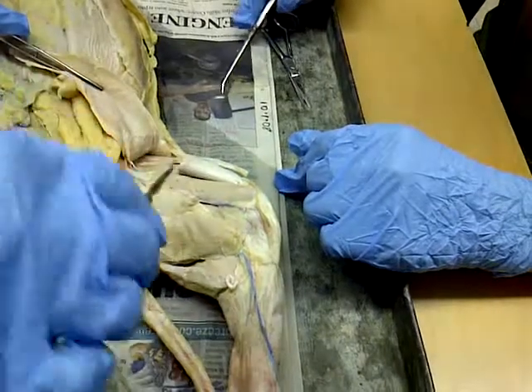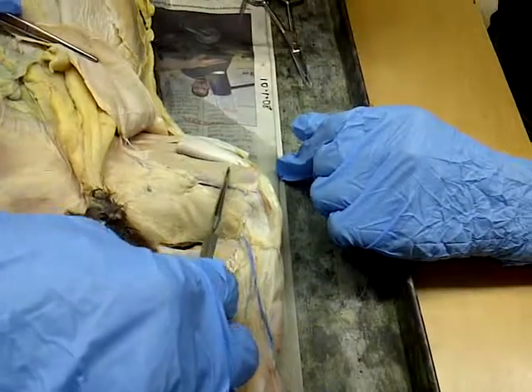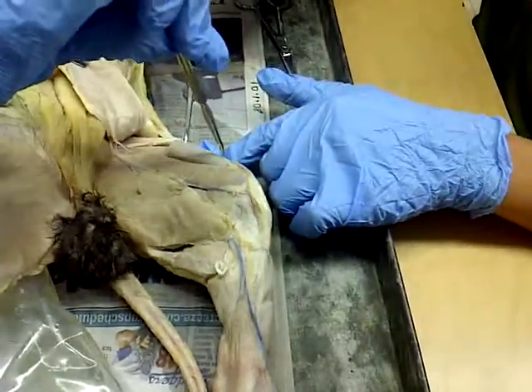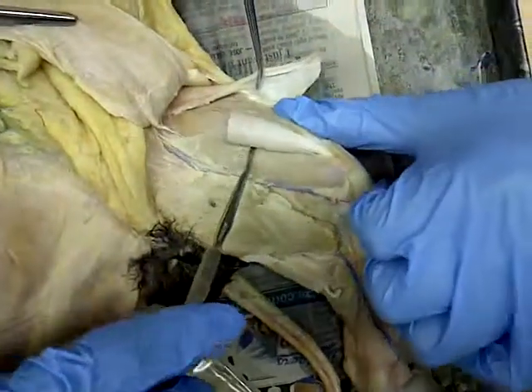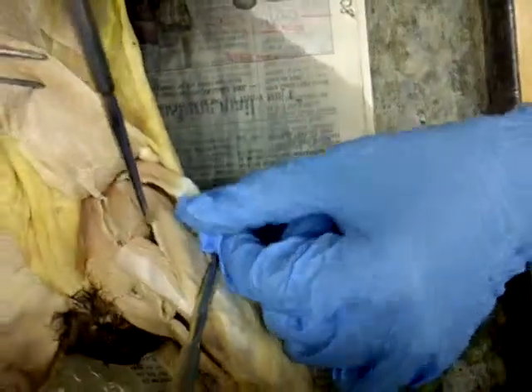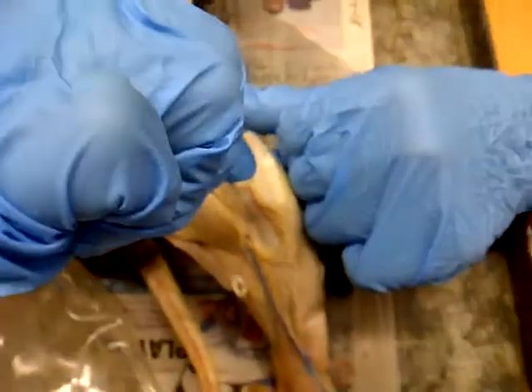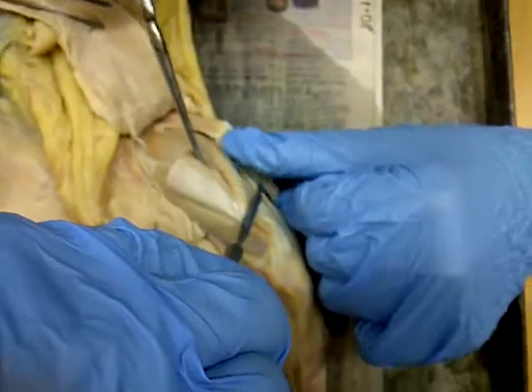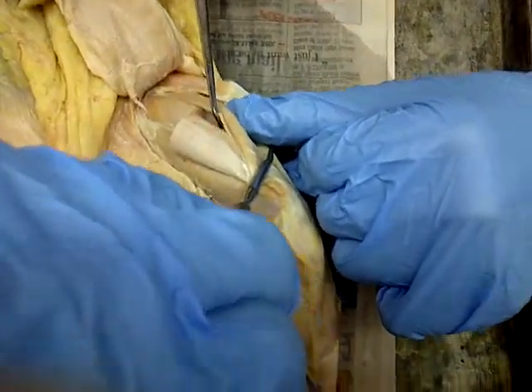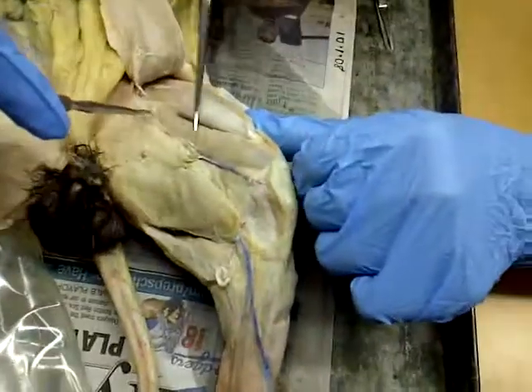And this one right here is the vastus medialis because it's on the inside portion, the medial side. And then on this side is the rectus lateralis. Can you lift that up a little bit more? This one right here, not the rectus femoris. Oh, no, vastus lateralis. Don't say rectus, sorry. I'm being a bad teacher. Vastus lateralis. It's on the outside, on the lateral side. And then on the other side we have the vastus medialis, because that's the medial side.